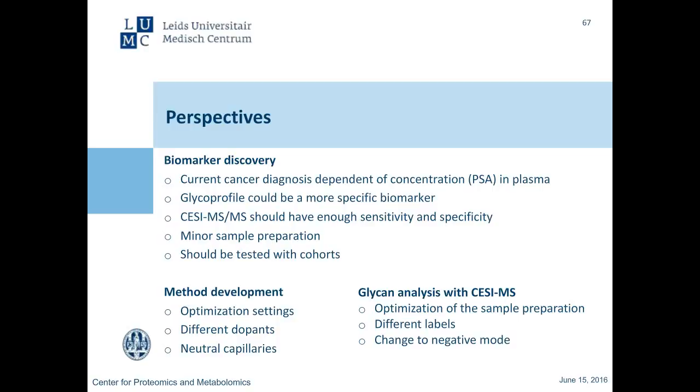For the different dopants, it might also be interesting because we now use acetonitrile, but different dopants can also have different effects and maybe even enhance the signal further. And in all of our research, we would like to try to analyze our samples on neutral capillaries and see what the effect of that is.